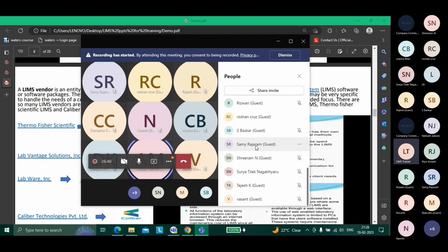Like my sample table, my product table, my product grade stage table, how they are linked, my item code table, my users table, some basic flags. Going ahead, everything will change, but there is some basic architecture. Try to understand that. That is the backbone. Generally, they won't change the backbone. So in our later courses, I'll try to hit on those backbones. Many table structures will change, some table names will change, but there are many tables that stay.